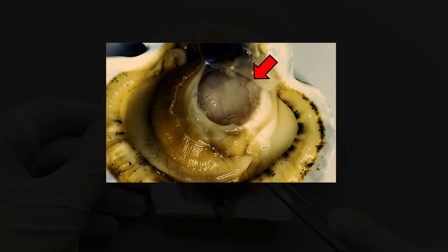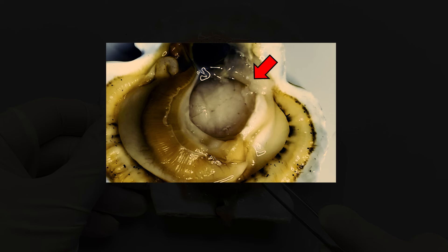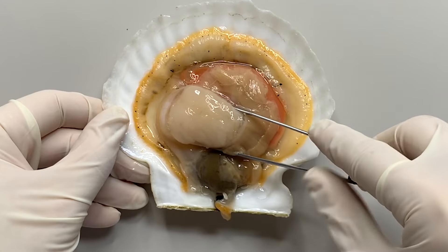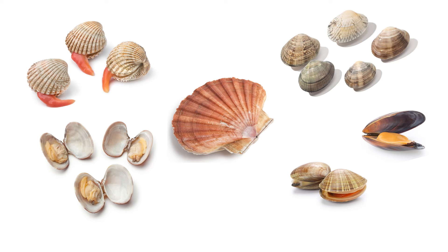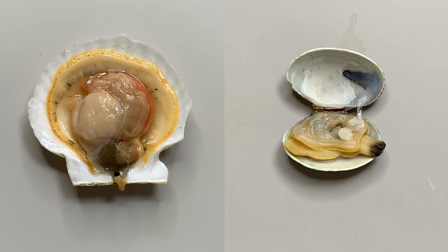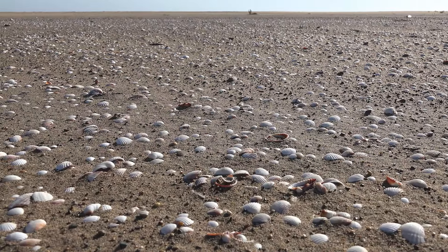Scallops can open and close the shell by contracting and relaxing this muscle. You can see the contraction and relaxation. Scallops are much loved as food because their adductor muscles are well developed. The body structure of bivalvia is different according to their habitat, so I prepared a bivalvia creature who has a different lifestyle from scallops.